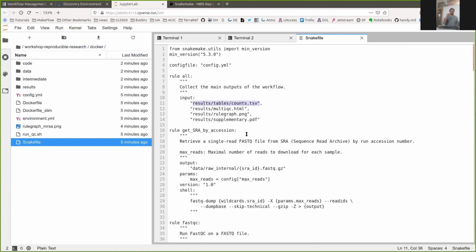It is important to understand here that in Snakemake, the logic is implicit and backwards. Based on what we asked Snakemake to create in this target rule called rule all, Snakemake will go back and check the dependencies of the rules that are implicit and force the execution backwards.